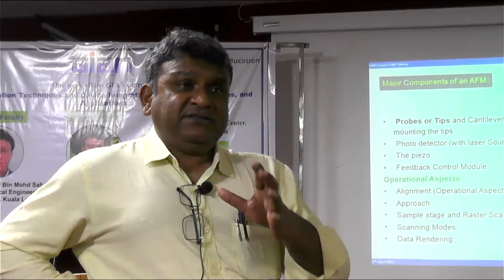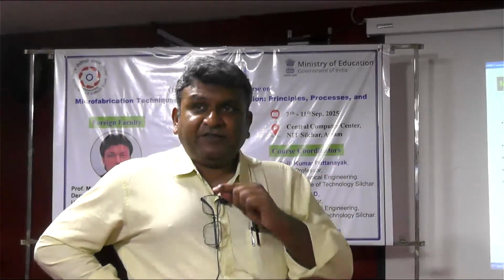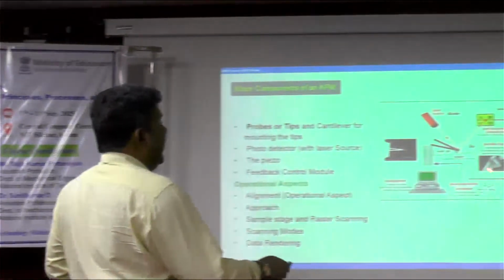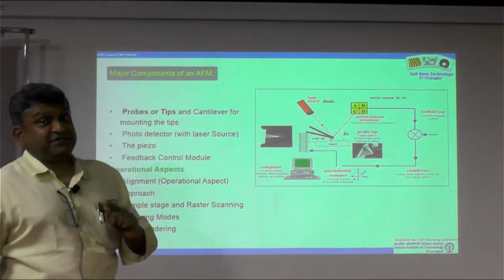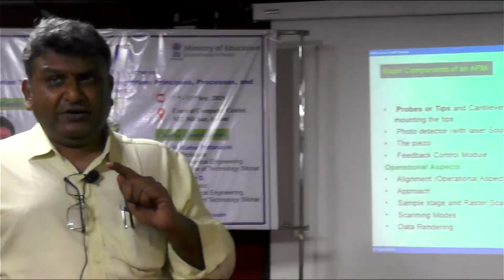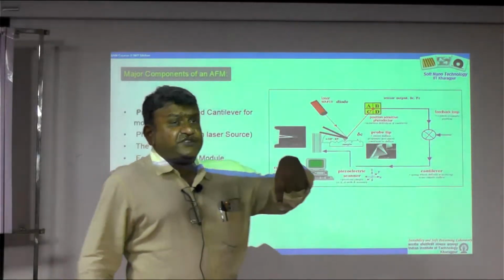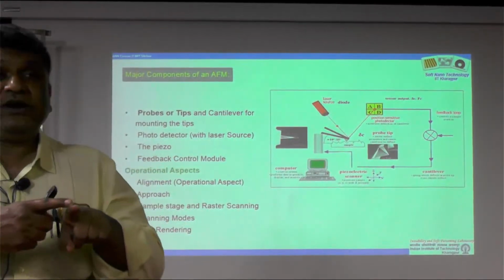This whole arrangement of the atomic force microscope uses a tip again, but the tip is used for a completely different purpose, not for tunneling current anymore. This AFM tip, which you can see here, is one of the finest examples of micromanufacturing, let me tell you. It is made of some material like silicon nitride. This tip is not just attached to a piezoelectric scanner like in a scanning tunneling microscope, but is mounted on a cantilever.